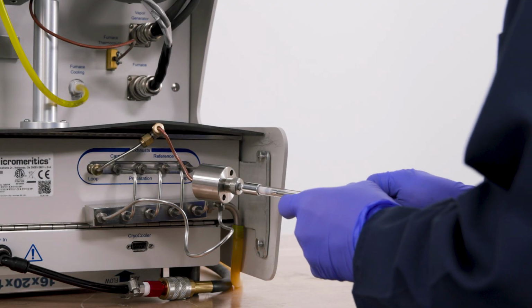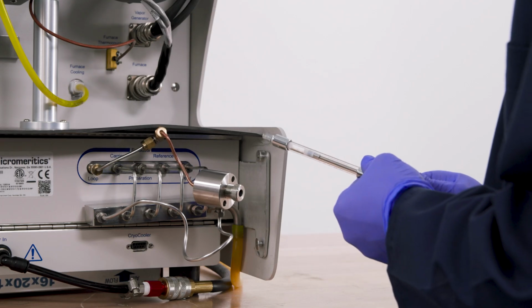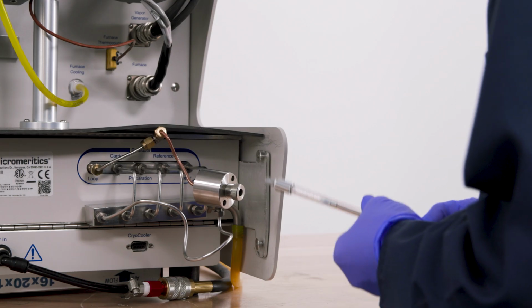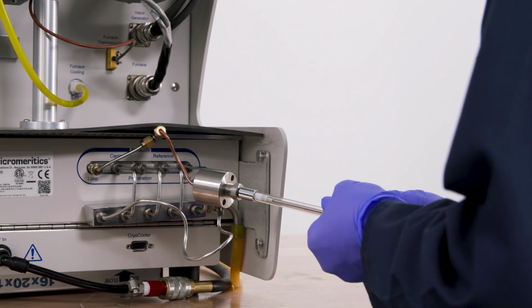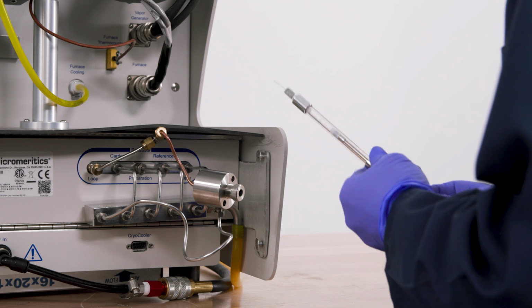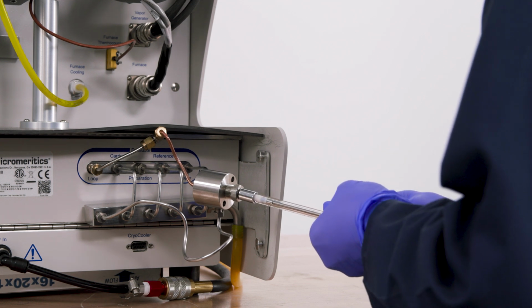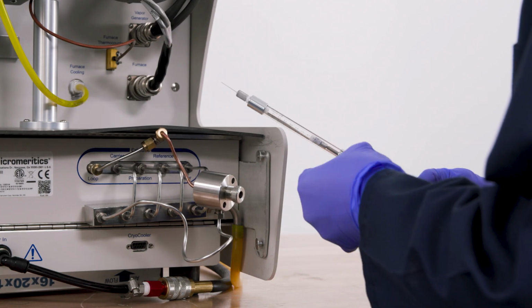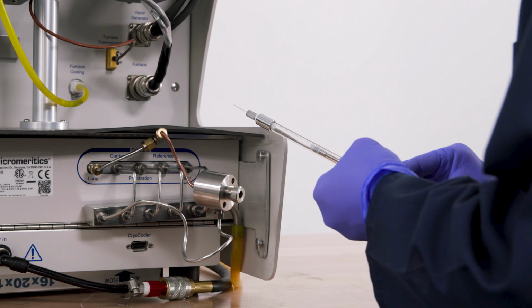First, the syringe should be cleaned by drawing and removing the argon gas several times. Then draw the appropriate amount of argon. Be careful not to touch the glass section of the syringe when making the injections because this changes the temperature and thus the volume of the gas inside.